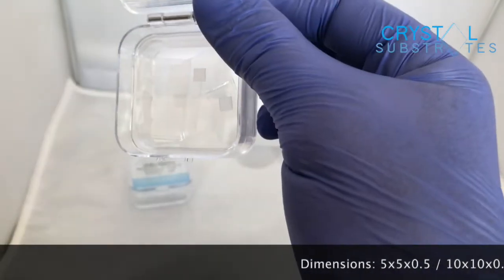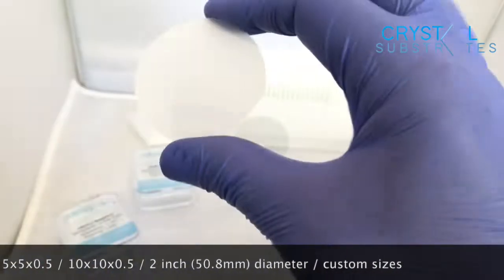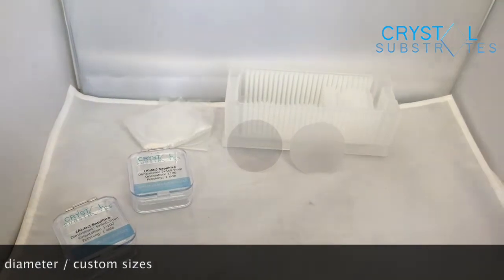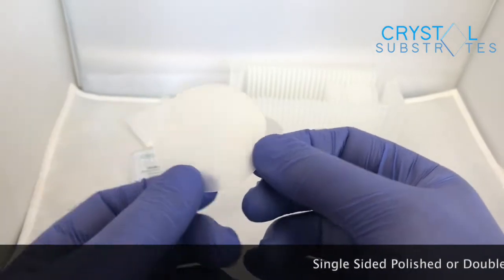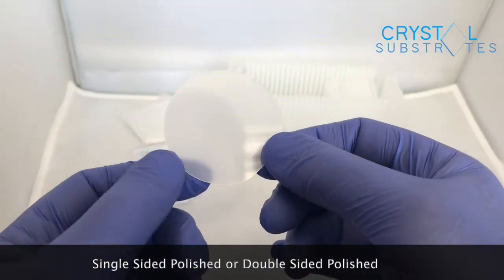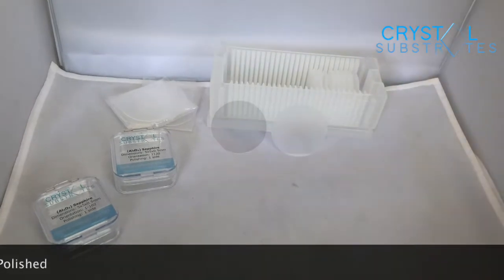You can have it in any size you want, from quite small 5x5, and we can cut them any size you like. These are two inches, but we can go all the way up to four inches. Sapphire grows in big long crystals and has a very low number of defects, so they're very easy to chop up, and because it's very hard they're easy to polish down to a high surface quality.